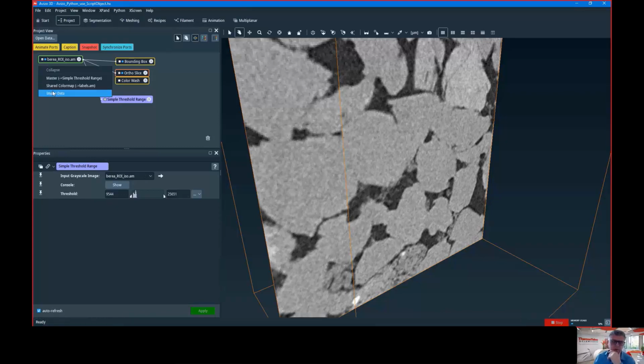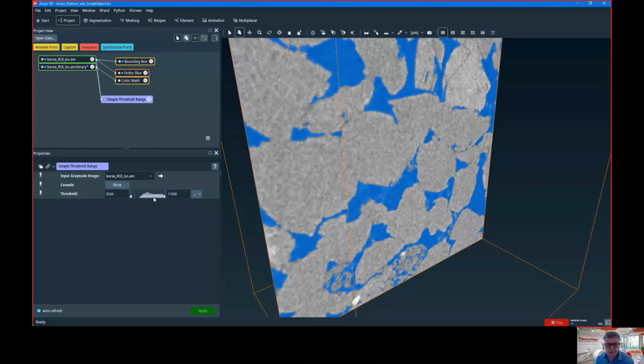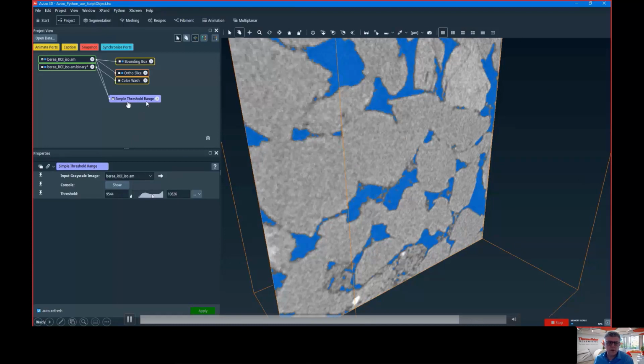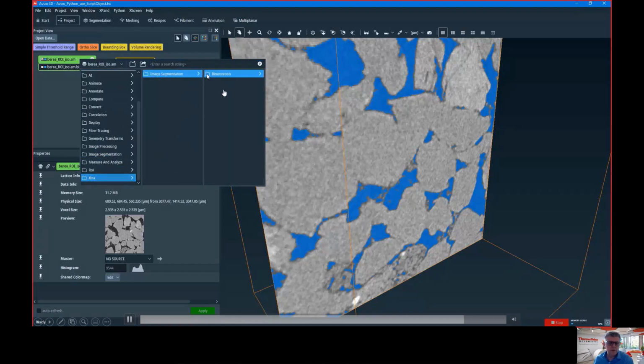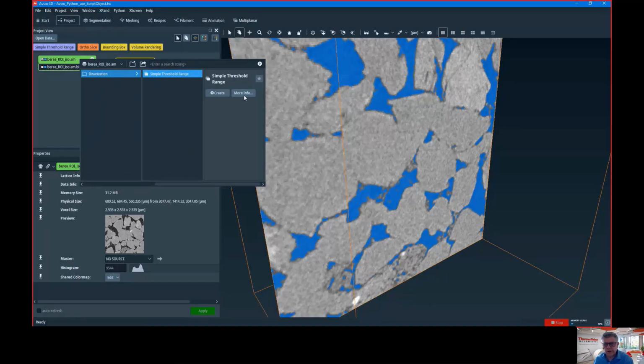Okay. So this is quite powerful if you understand it. I mean, I'm a computer scientist. For me, it's really something amazing because you can have your own science in your own custom module while keeping Avizo. And if you know Python well, you got the point. You can create new modules. You can create workflows. Everything could be written in Python, basically. So if you get some students with this knowledge, it really opens up a lot of possibilities to extend Avizo.